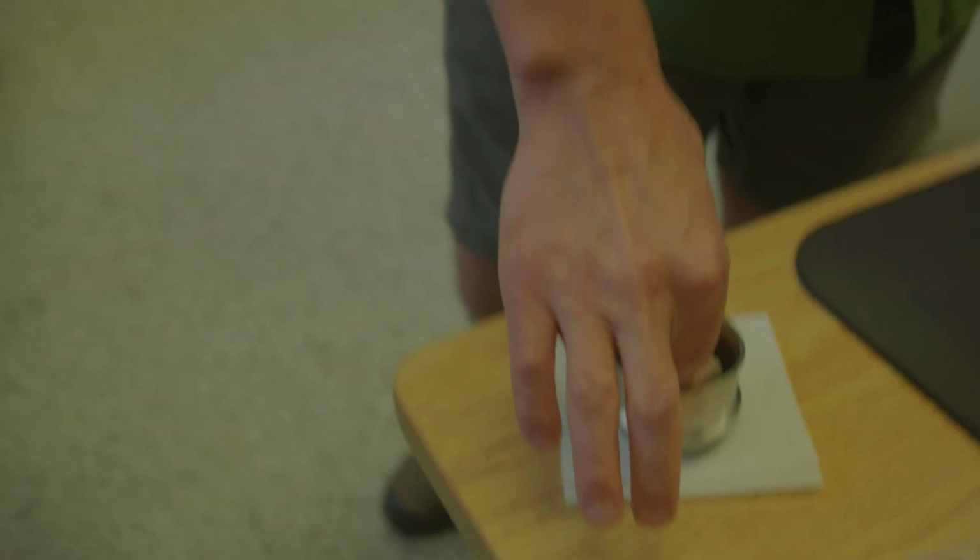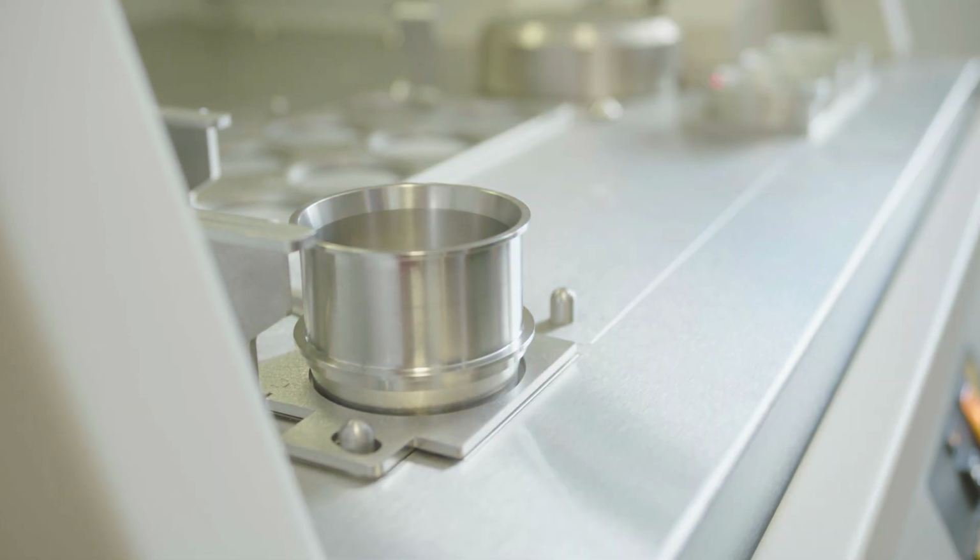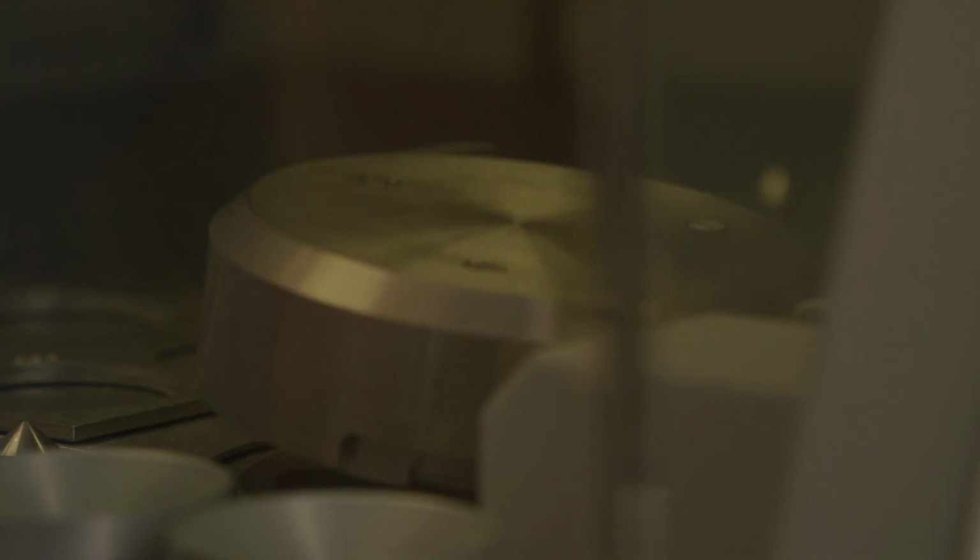How do you load this thing up? So I'm going to take the geological sample that we took from the quarry, and I just literally put it in the sample holder, and then I basically open the door here to the XRF, and then we put it right here. And I close it because there are X-rays, so we have to be careful. I have to program the sample and tell it what to do. Do I want it to analyze it for 10 minutes, an hour? What kind of elements am I interested in? And then it'll take the sample, put it in the actual chamber where it's really exposed to X-rays, very strong X-rays. So, an hour.